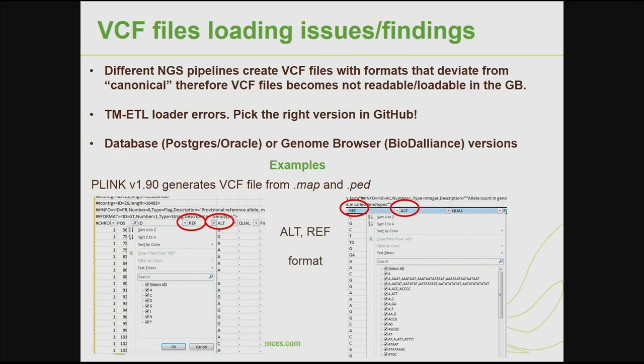We have noticed that different NGS pipelines create VCF files with formats that deviate from what I call canonical format. Therefore, VCF files become not loadable or readable in the genome browser. We have also noticed that there are several commits of TM ETL loaders, and if you pick the right version on GitHub you will be successful to load VCF data; otherwise you need to try more versions of TM ETL. There are also different versions of BioDalliance genome browser itself, so we need to keep all these factors in mind.